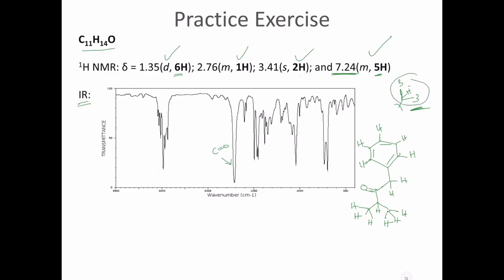This proton is supposed to be split 7 times. That's the multiplet we have over there, which makes sense. These protons are not supposed to be split because there's no adjacent proton here, there's no adjacent proton there. So it's going to be a singlet. And that helped us to determine the structure of the compound. So the compound looks like this.